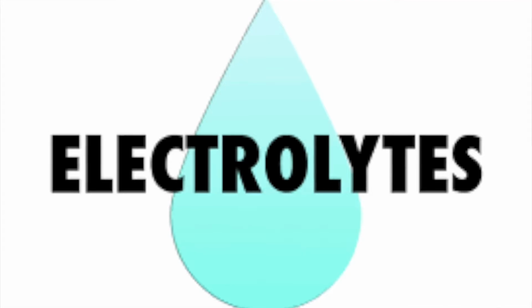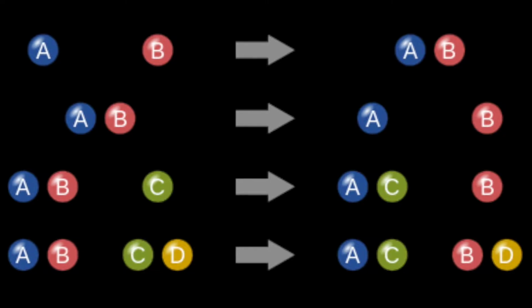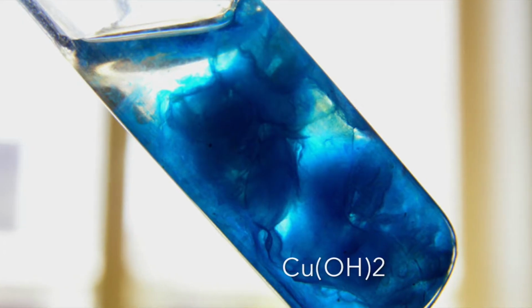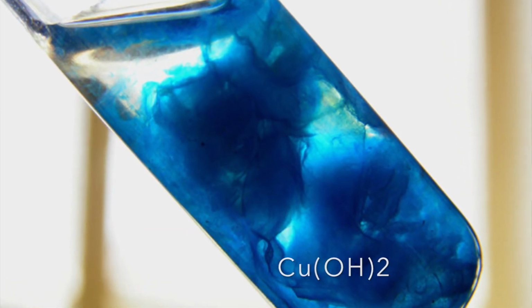Observations and data. Before the chemical reaction, potassium hydroxide was a clear liquid and copper sulfate was a blue liquid. Both reactants were electrolytes. After the chemical reaction, the product formed contained a precipitate, Cu(OH)2, making it look flaky or powdery. There was also a liquid in each test tube, which was the other product dissolved in water, K2SO4.